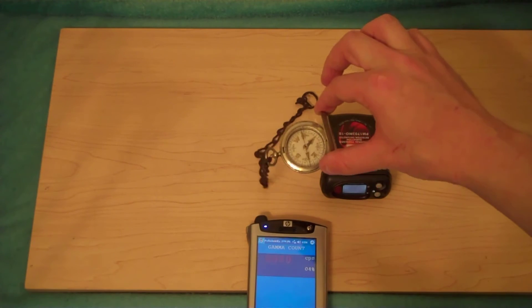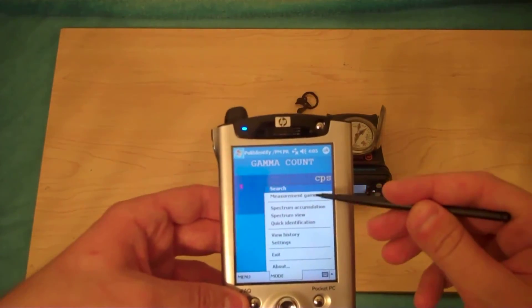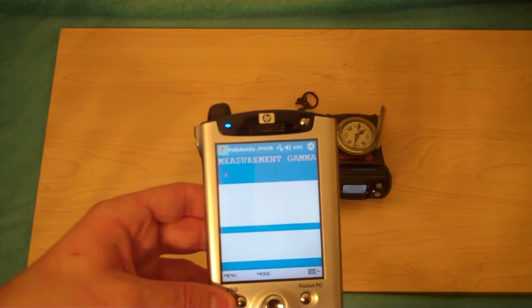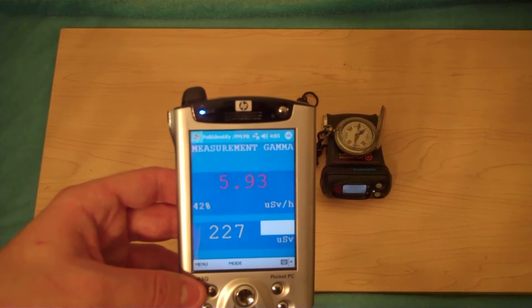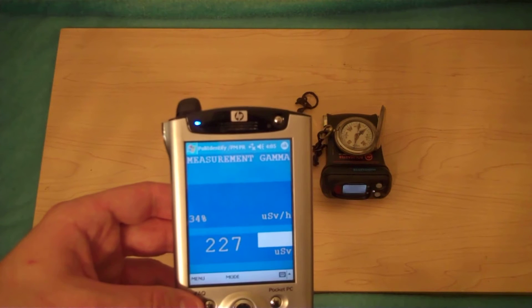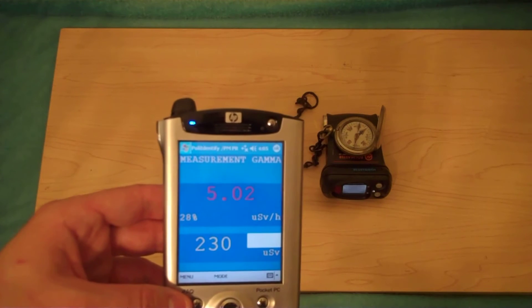Now if we put the compass on top — it doesn't have to be on top, it could be several feet away, but putting it on top will do it a lot faster. Let's find out why it's radioactive. We already know it's radium-226, but let's confirm that and pretend you didn't know. Maybe you just found this in your grandpa's desk and wanted to find out. We can switch to gamma measurement mode first, before doing an isotope identification, and see a much more detailed layout showing microsieverts per hour. That 5.5 microsieverts per hour is what you get from holding this thing — that's not so good. I'd prefer not to put that in my pocket, which is probably where service people put it. Of course, this unit actually gets more radioactive over time due to the decay of radium-226 into its various daughters.